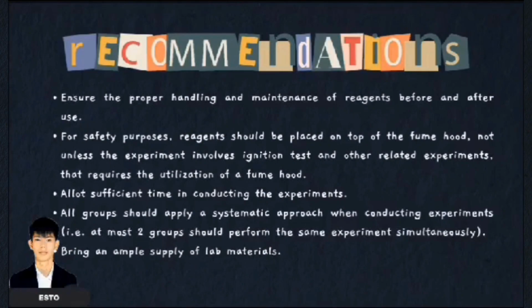Allot sufficient time in conducting the experiments. All groups should apply a systematic approach when conducting experiments. For example, at most, 2 groups should perform the same experiment simultaneously. And lastly, bring an ample supply of lab materials.